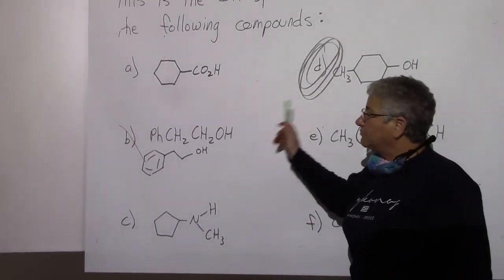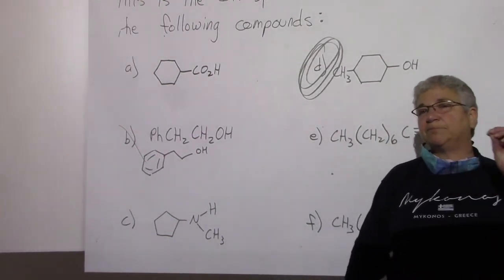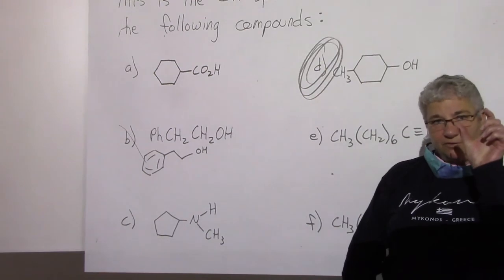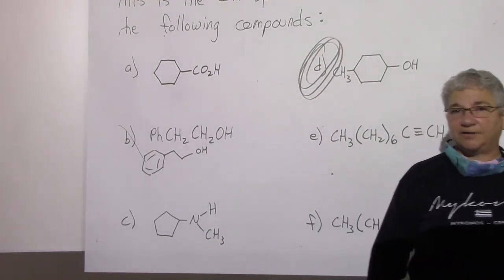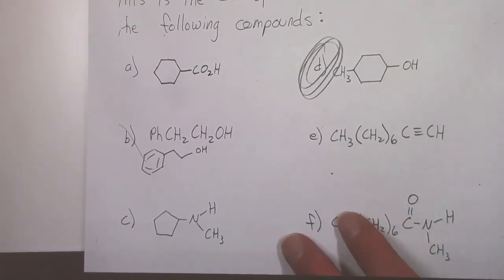Okay, so these other ones you could cross out pretty easily. These two, you had to really take a close look at that region and say, are there peaks above 3000, well, 3100 to 3000 or not? Okay, that's what you were looking for there. All right, so the last thing, your assignment.